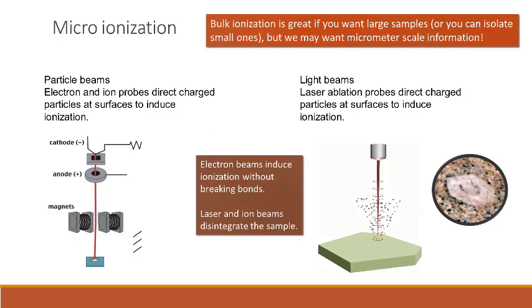What I've been describing to this point is the bulk ionization that happens when you subject all of the sample to ionizing energies. What if you're just interested in a small volume? Well, we have techniques for that as well.